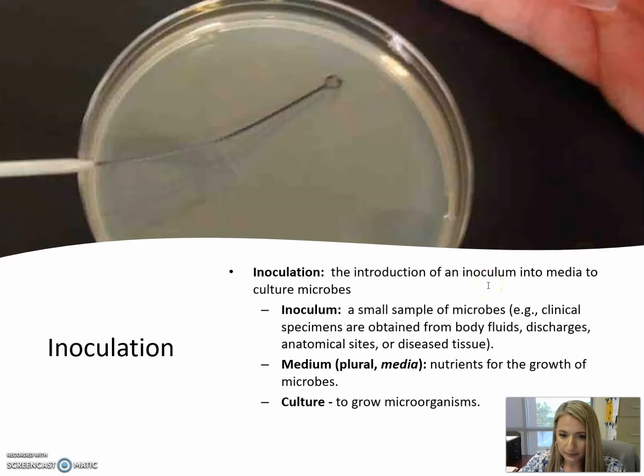So what's media? Media is essentially food for microorganisms. So the media contains the nutrients that are required for bacterial growth. So they can feed off of those nutrients in order to gain energy to continue to grow and divide. So we know that inoculation is the introduction of an inoculum into media or food to culture the microbes.